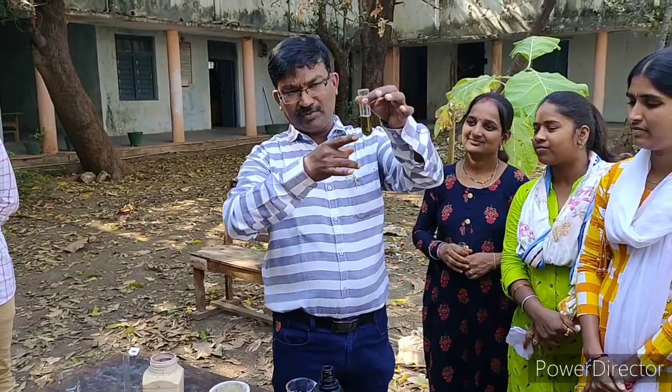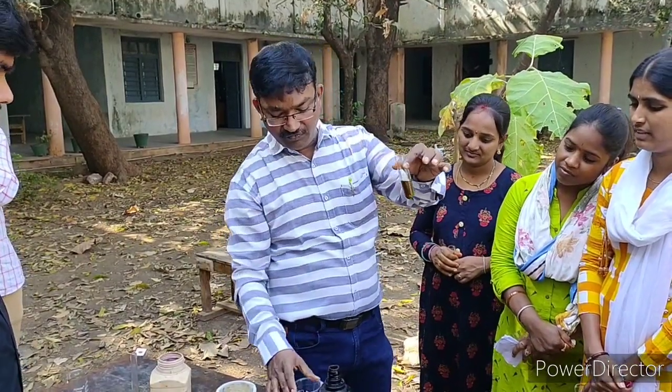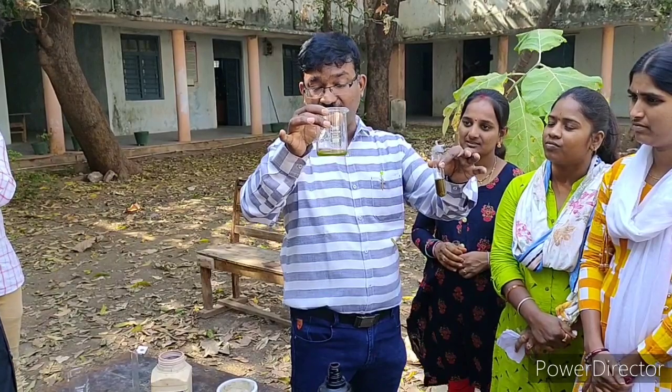Now look here — beta-naphthol is completely dissolved in the NaOH solution. After that we have to take 3 ml of dimethyl sulfate.